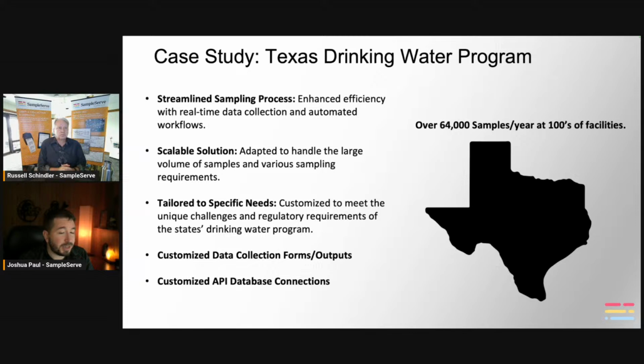And you can get your whole facility set up within, I'm going to say a week, maybe even less than that. Yeah. And it's surprisingly simple is what I like to call it. And what we charge is more than offset by the savings that you incur. Oh yeah, absolutely. The ROI, return on investment, is very quick. And if you stop missing samples, and your data becomes a lot more accurate and efficient to transfer, that's going to be a huge time saver.